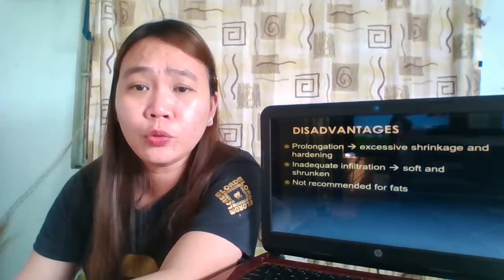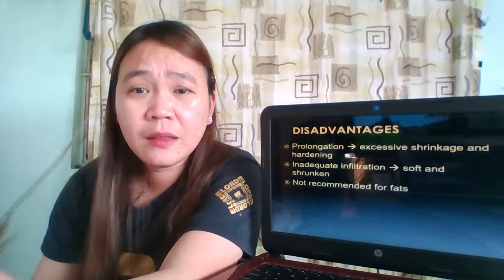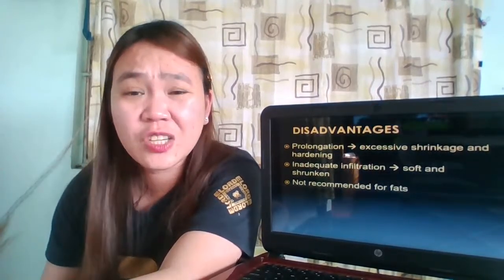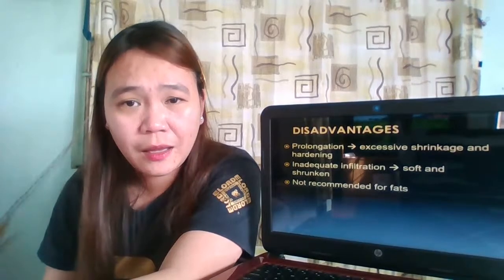What will happen to your paraffin? Your paraffin will dissolve. That's why your tissue sample will become soft and shrunken, because you did not remove the clearing agent completely.